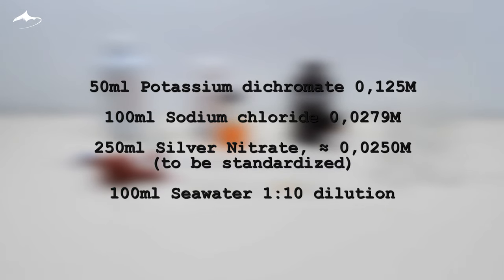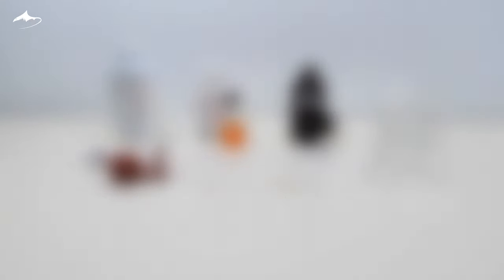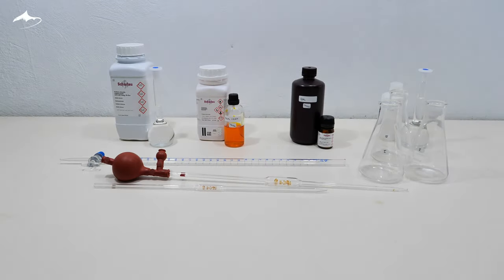At this point, these are all the solutions that were prepared. From top to bottom: indicator, primary standard, titrant, and sample solutions. With all of this, we can now start the analysis procedure.